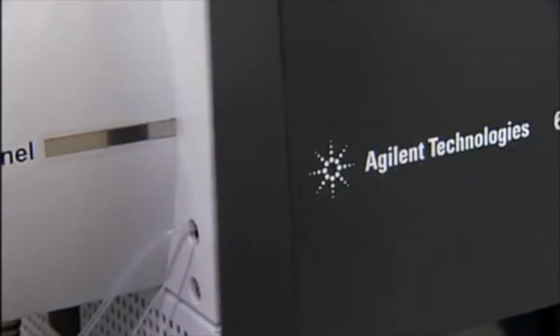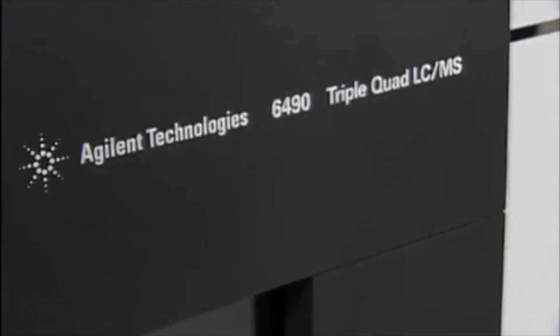The new iFunnel technology increases the number of ions entering the mass spec, increasing both sensitivity and specificity. The ion funnel is made up of a hexabore capillary sampling array in line with two offset ion funnels. This setup allows more ions to enter, be focused, and separated from any background material, improving both sensitivity and specificity.